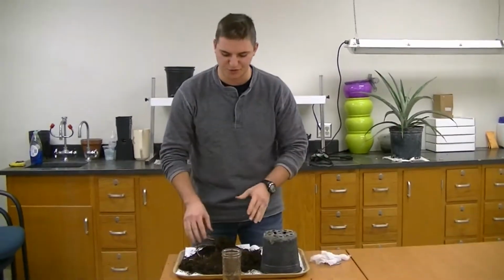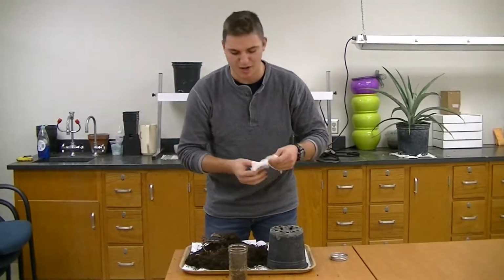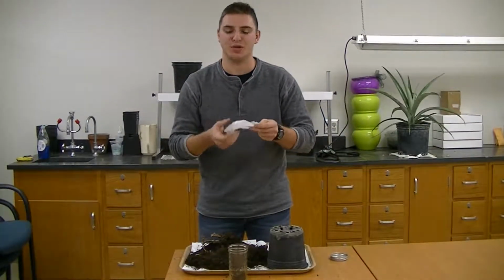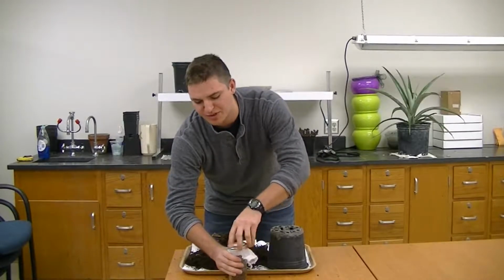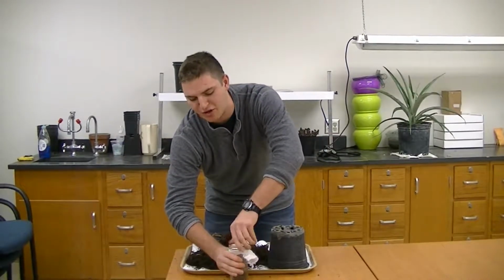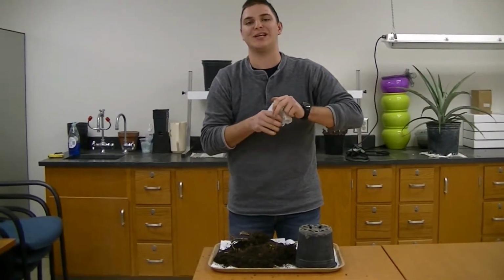Isolated a lot of root tissue from our infected plant, so we've put it inside our mason jar. The next step is, depending on what you have at your disposal, you can use cheesecloth or you can use a nice wire mesh. You basically want to cap the material into that mason jar and make sure that it's nice and snug and won't be removed during the cleaning process.